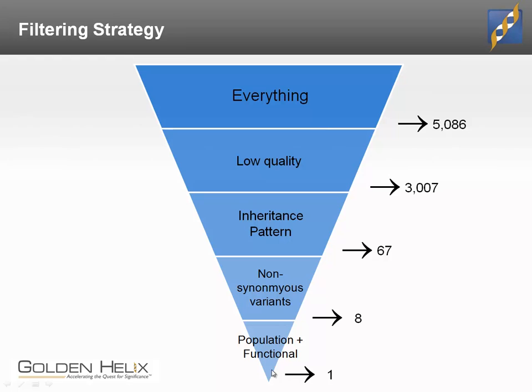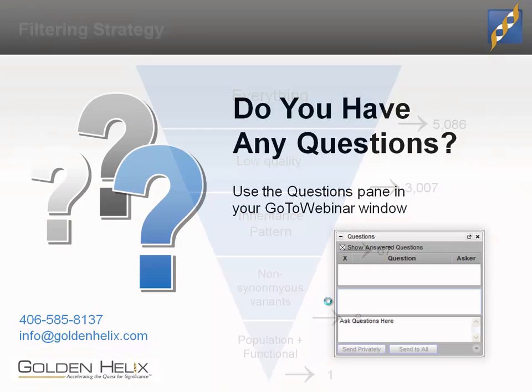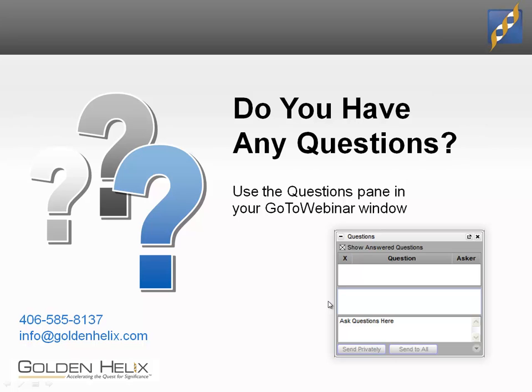We've gotten to our one variant in NAA10, the one we would expect that matches the variant published, and we did it through an orthogonal, highly transparent set of steps using SNP and Variation Suite and Genome Browse. And so, that was the goal of this.